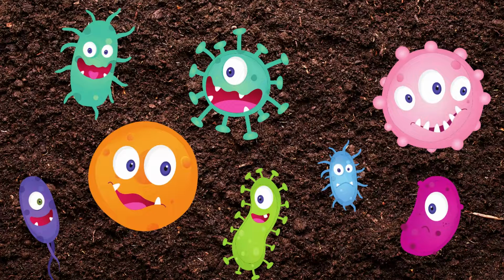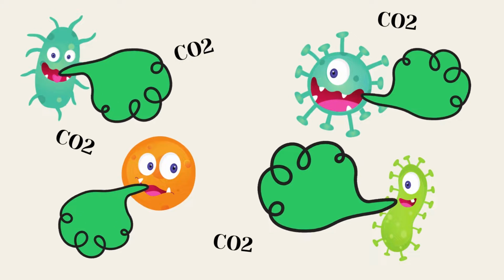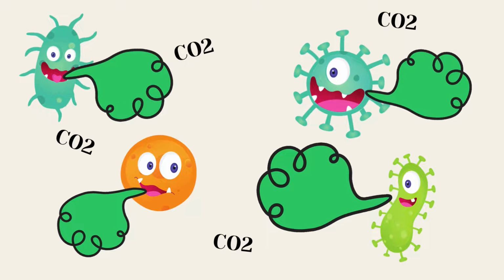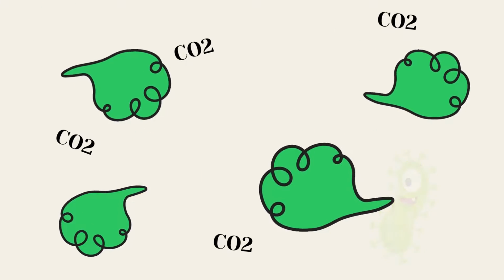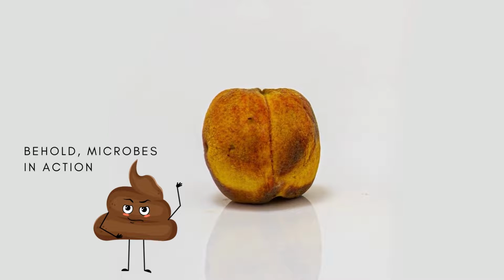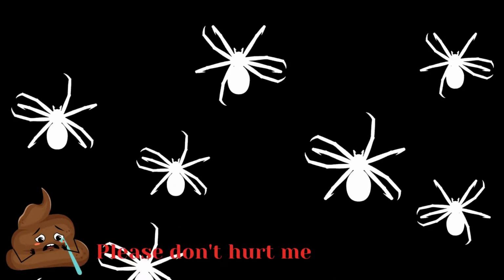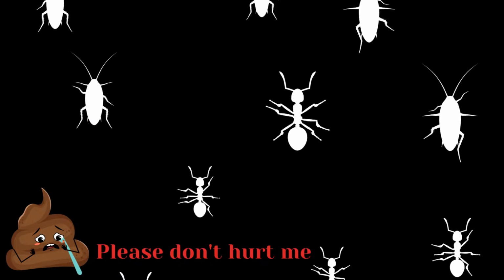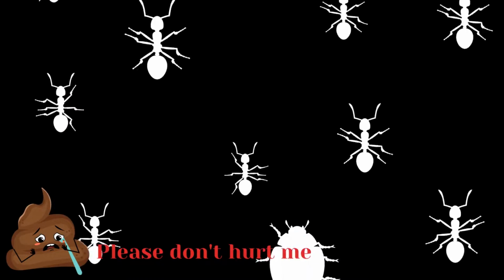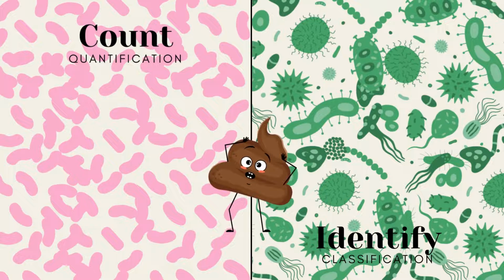We've talked about soil microbiology a little bit when we talked about soil respiration, the CO2 that's being released by microbes. And we also talked about it when we talked about carbon degradation, because soil microbiology is a big part of that. We touched on it a little bit when we talked about soil bugs, soil arthropods, because those are a part of that larger soil food web and ecosystem. So today we're going to talk about measuring a little bit more directly the number and variety of microbes that are in the soil.